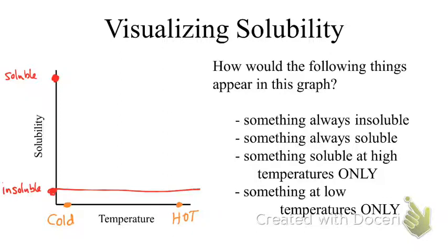What if something's always soluble? Raise that line. We're just going to run it up at the top. Okay? What if it's soluble only at high temperatures?